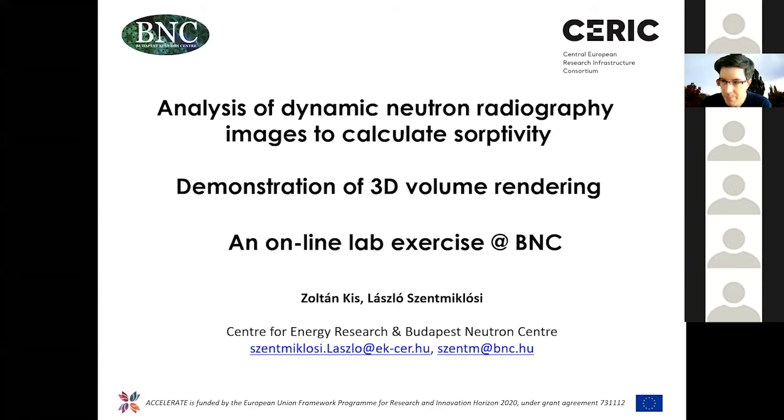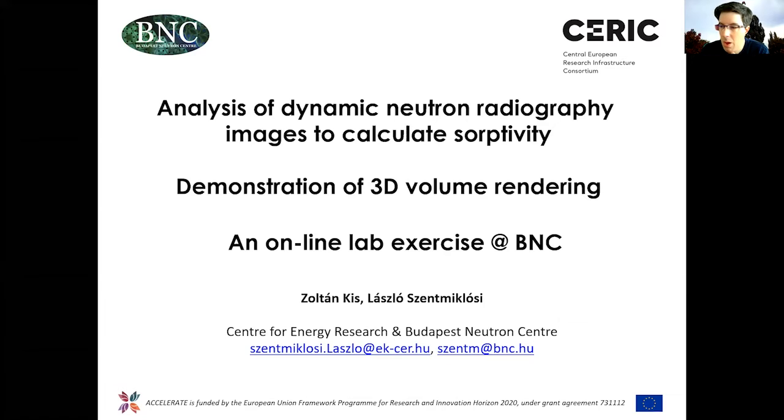So this lab training will have two parts. The first part will be devoted to the presentation of an already taken experiment for dynamic radiography, where we will make a very simple experiment to check the water uptake of a pH paper. And this we will elaborate together.